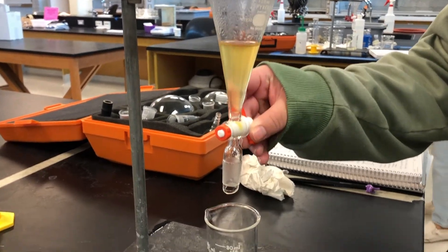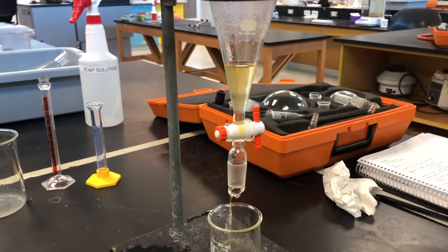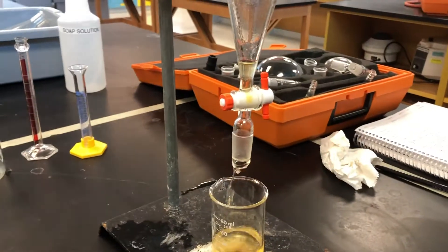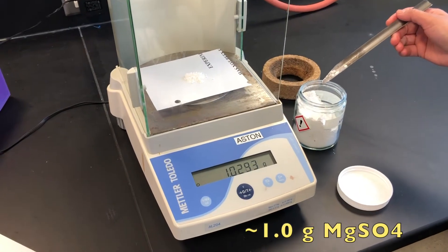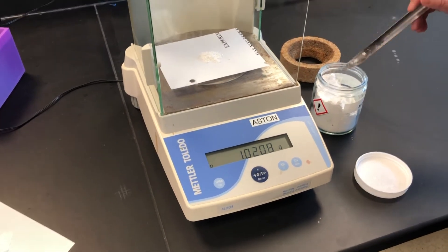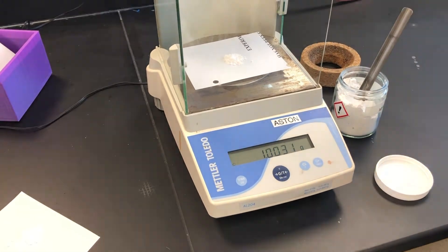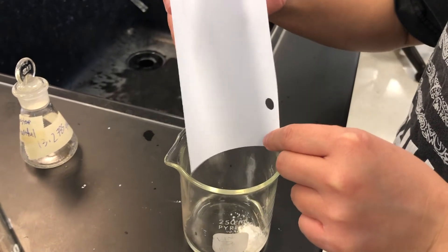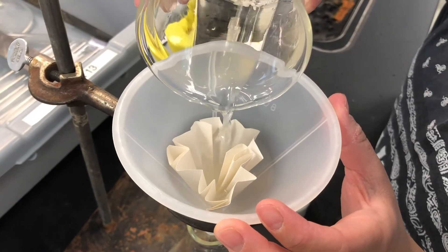Once you separate the layers, put the organic layer in a beaker, then add the drying agent magnesium sulfate. Make sure to mass out 1 gram of magnesium sulfate. Using gravity filtration, separate them.